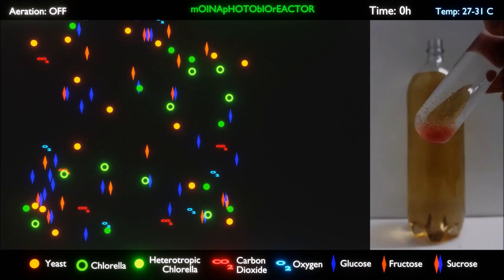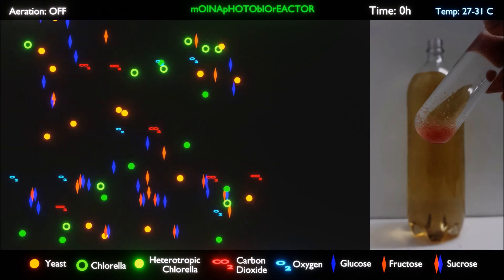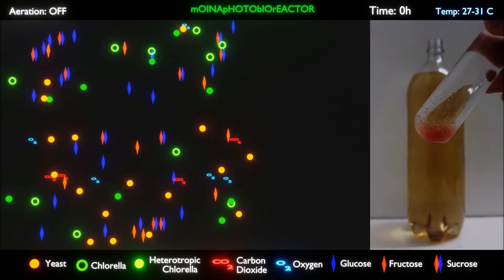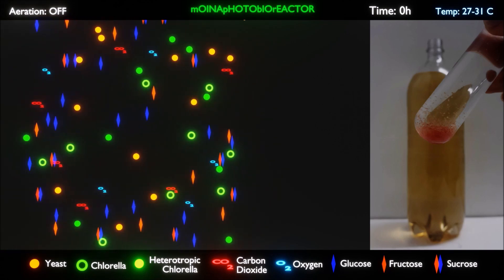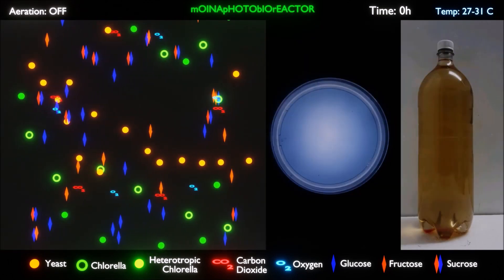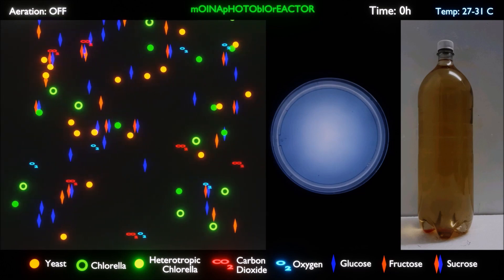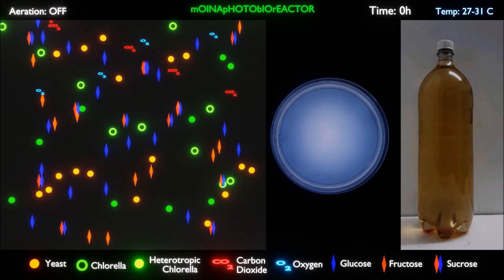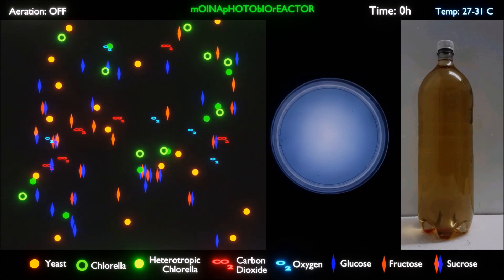Moina is added. The amount of Moina seeded into the photobioreactor is extremely important. Too much Moina per liter will use up all the Chlorella and yeast at the initial stage. What we want is for the symbiotic culture between yeast and Chlorella to be least affected by Moina at the initial stage. As a rule, seed the culture vessel with 100 Moina per liter. We will observe the propagation of one Moina in a petri dish, which is airtight and has the same environment as the photobioreactor. The petri dish contains a volume of 20 milliliters of 25% Medium A and 75% Medium B.